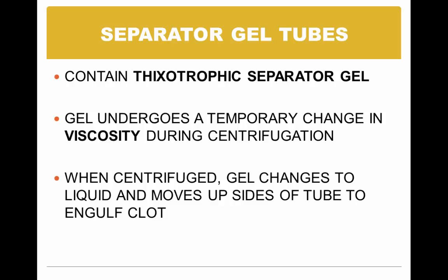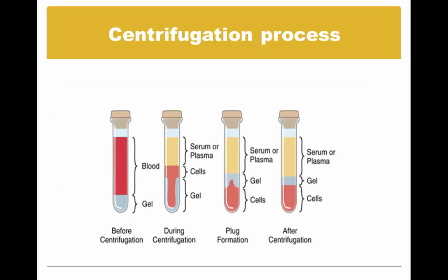She has down here that on page 845 in your book there's a picture of that. This shows you the centrifugation process before, during, when the plug formation happens, and then afterwards what the specimen will look like, okay?